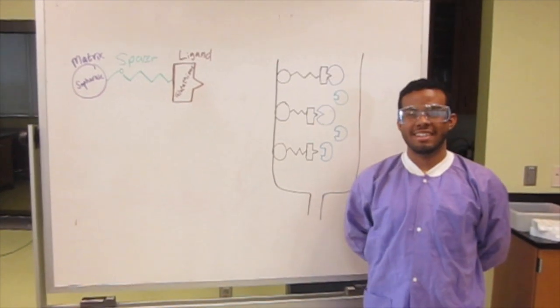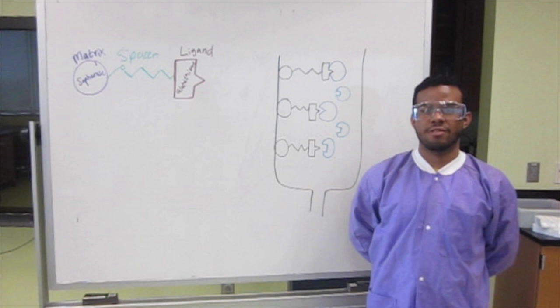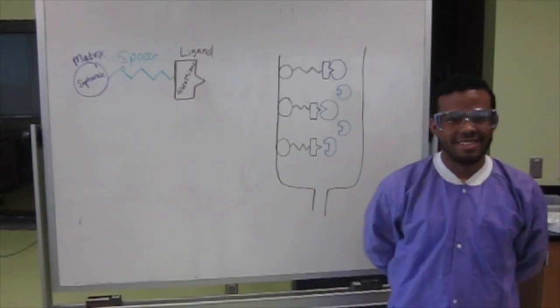Hey guys, today we're going to be performing affinity chromatography. The purpose of affinity chromatography is to purify a target protein from a cell lysate, and today we're going to be using a selective glutathione column. In this experiment we're going to be purifying GST Campari.